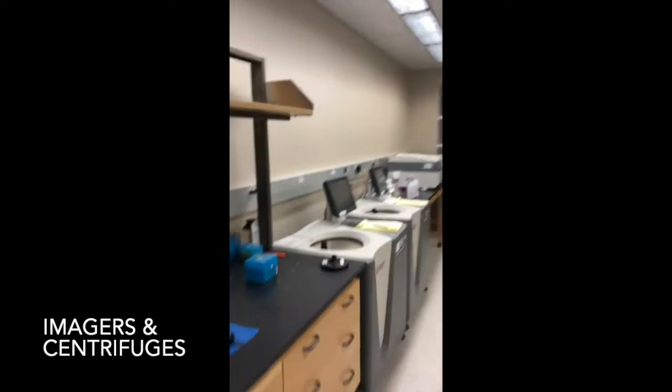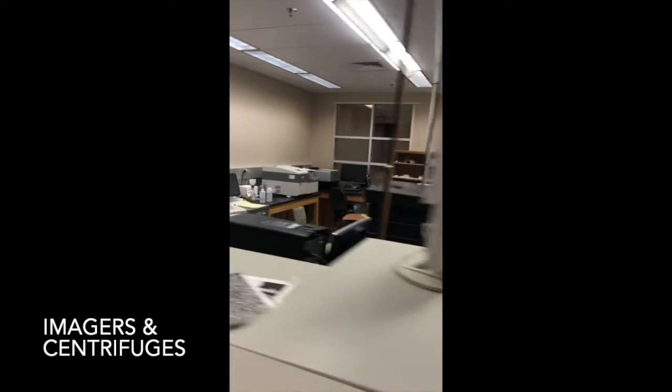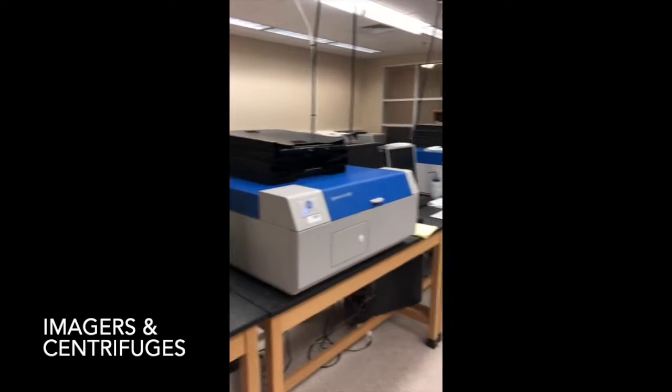So there's a lot of imaging capacity in this room. Large capacity centrifuges also. Again more imagers here.